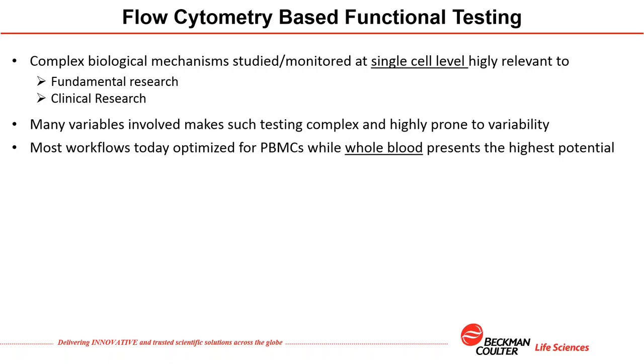All of this information is being gathered at a cell level. The downside with this kind of flow cytometry-based functional assays is that those involve a lot of different variables, and as such, they are highly prone to variability.